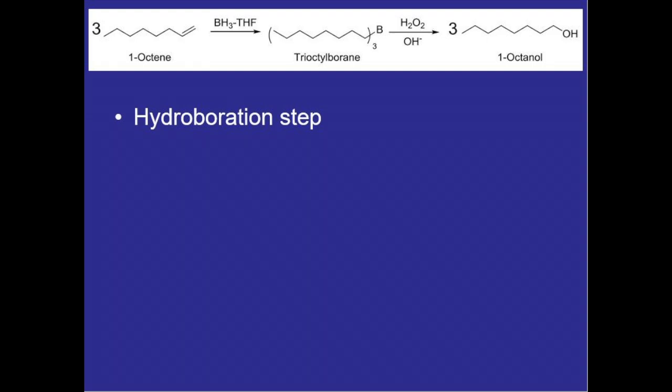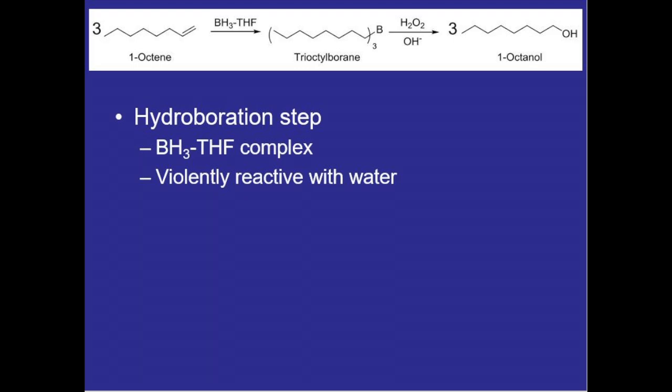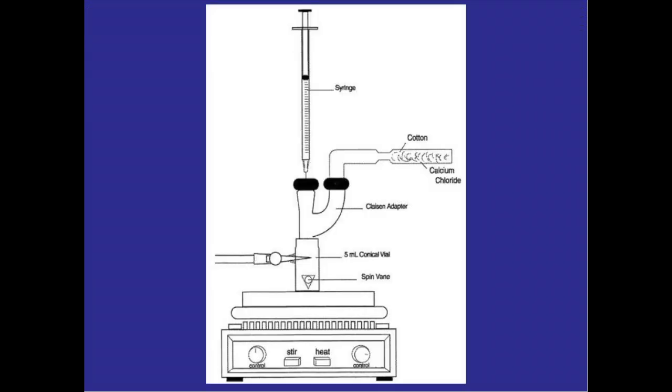Okay here's a quick look at the hydroboration step. We're going to be using a BH3 THF complex. Borane as itself comes as a toxic colorless gas actually called diborane and when exposed to a Lewis base like tetrahydrofuran or THF it forms a stable complex and that's more easily and safely handled than just a diborane gas. This complex is violently reacted with water so we want to make sure that our reaction vessel is dry so we're going to put our glassware in an oven to make sure no water is on it and we'll set up our reaction apparatus like so.